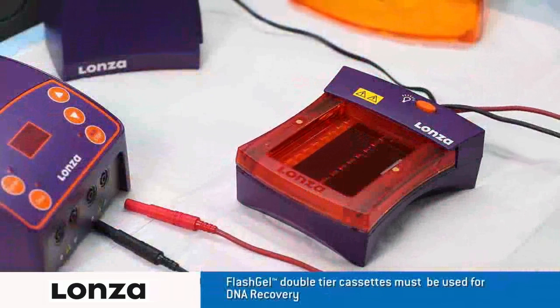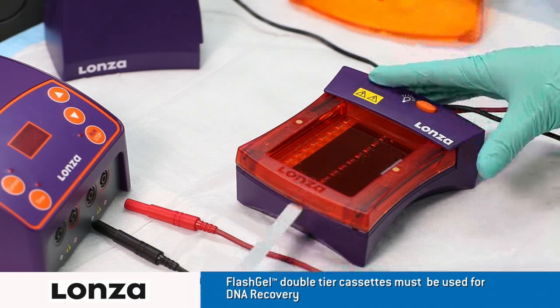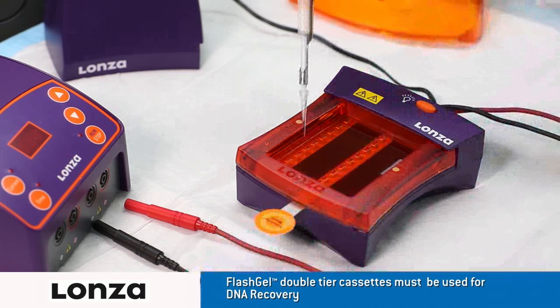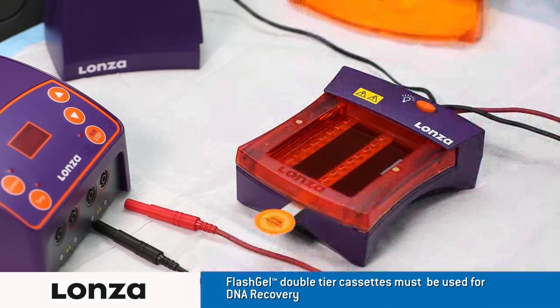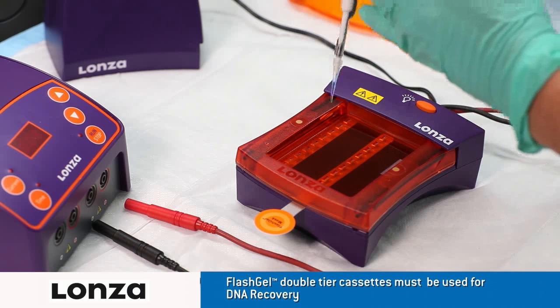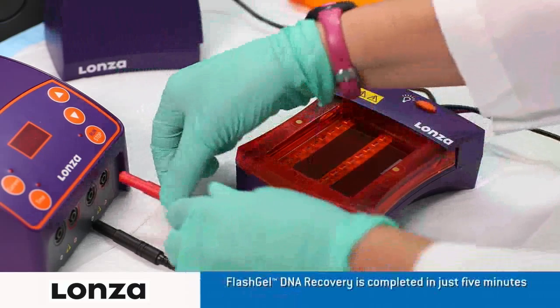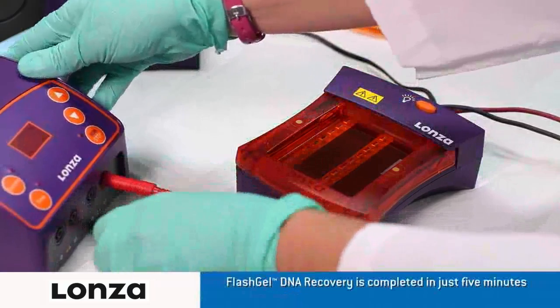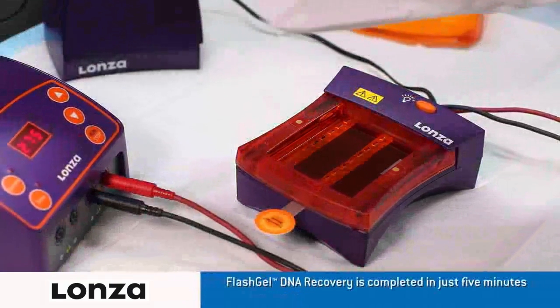Insert the FlashGel mask underneath the second-tier row to block the light. Prepare your samples using FlashGel loading dye and FlashGel markers, both designed to optimize performance. Plug the electrodes into the power supply, turn on the FlashGel dock, and then the FlashGel power supply, and set to run at 275 volts.